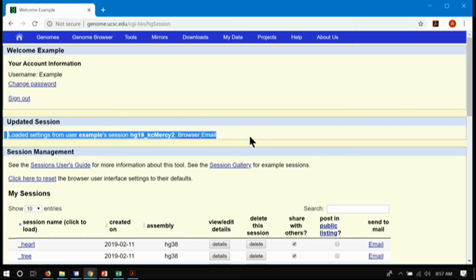updated settings? That little place, when you first do this, that's kind of cryptic. And I've argued internally to put this in red or flashing or something the first time, so it's a little bit more obvious. But I haven't quite gotten the attention of the engineers to do that. We don't do flashing anywhere. I knew they would never do that. So did you get it?